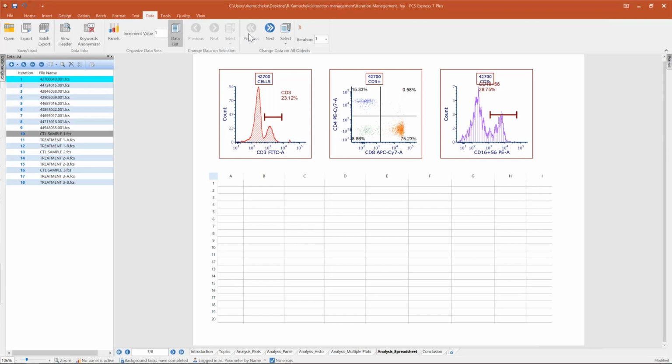They're not automatically gates, and even if they're converted to gates, you can't create them into a data-specific gate. So this is a way to do that using snapshots. It can be a really great tool to manage your data files and to manage how you're running your analysis.